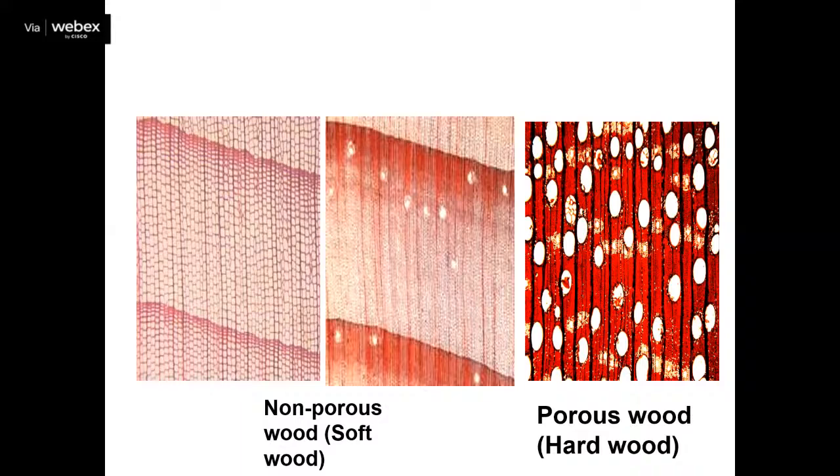The difference between hardwood and softwood is that in hardwood we see vessels or pores. Whatever round structures you are seeing in the third photograph are vessels or pores, and the parallel lines are rays. We see fibers, which are ground tissue, and then parenchyma will be there. In hardwoods, vessels, parenchyma, fibers and rays are present.